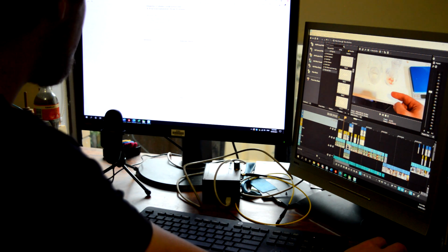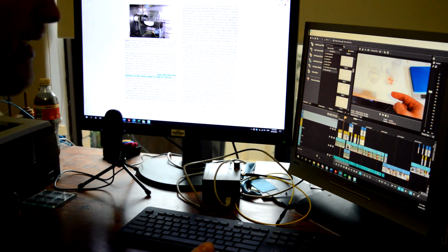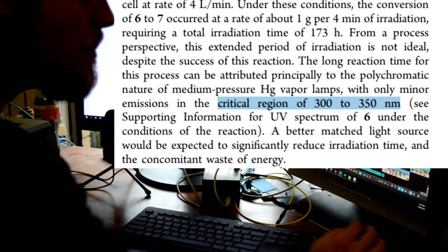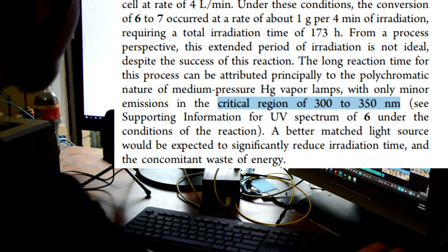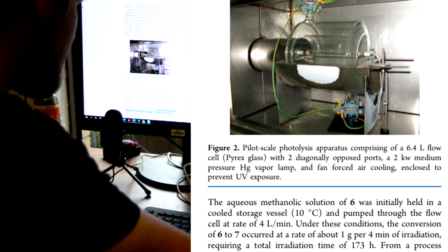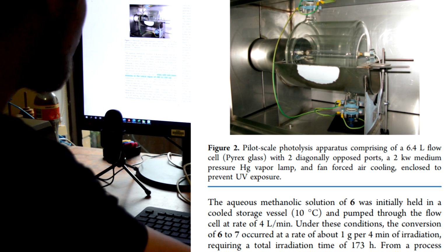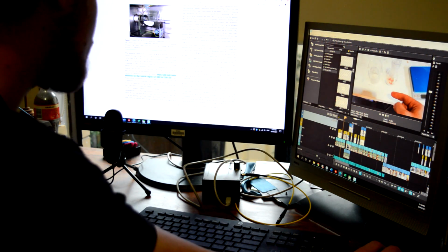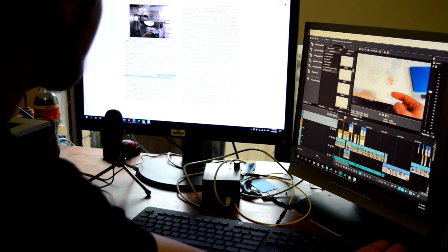When we go to these other two papers, the 1997 and the 2013 one, they are using once again these medium pressure mercury lamps, but they say they're trying to hit the region between 300 and 350 nanometers. What's a little strange about this setup is that they're intentionally using borosilicate glass here. It's a little unclear, but I think it's because they're using that borosilicate glass as a filter for the shorter wavelengths of the lamp. So they don't want anything below 300 nanometers getting into the reaction mix. Instead of using quartz, which is usually used in a quartz reaction setup because quartz is transparent down to there, when you go to borosilicate, it doesn't transmit those lower wavelengths.